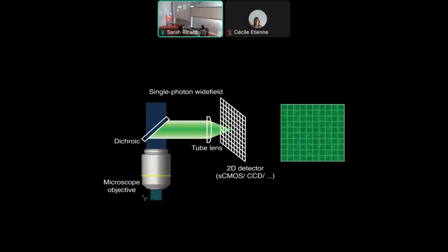All of which is to say that we're operating with an extremely limited photon budget. So if we were to use wide field microscopy in order to do this, essentially because we're exciting fluorescence from all throughout the brain, what we'd see on our detector would be the sum of the fluorescence that is excited in all of these planes. So essentially we would get a very low contrast image on our detector.